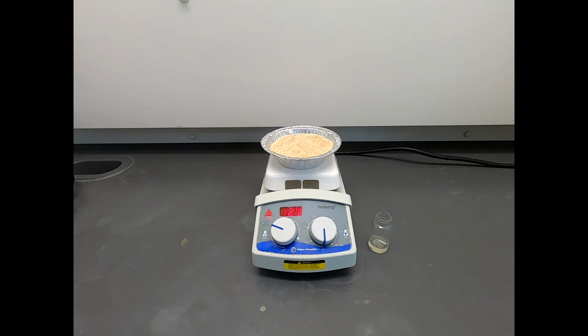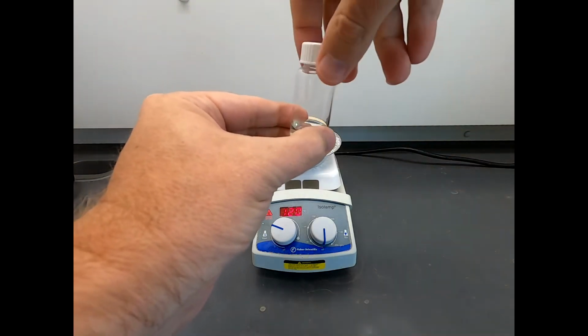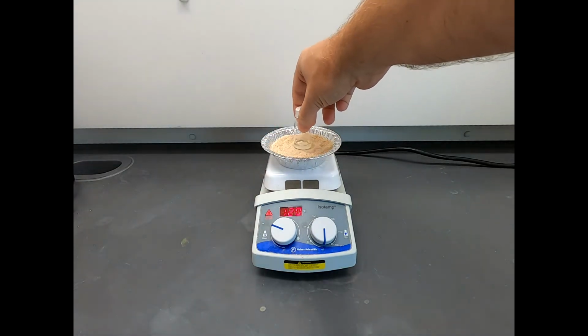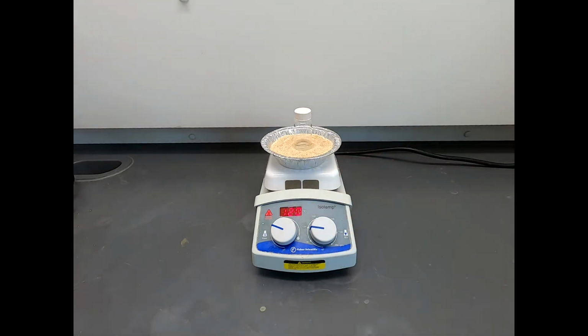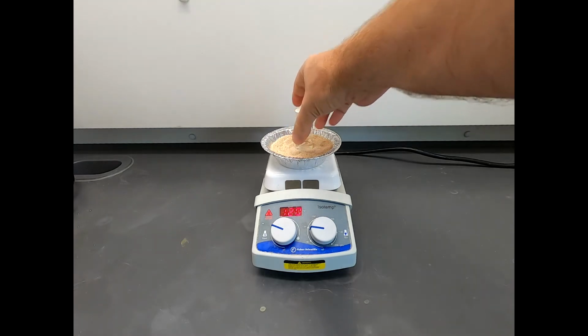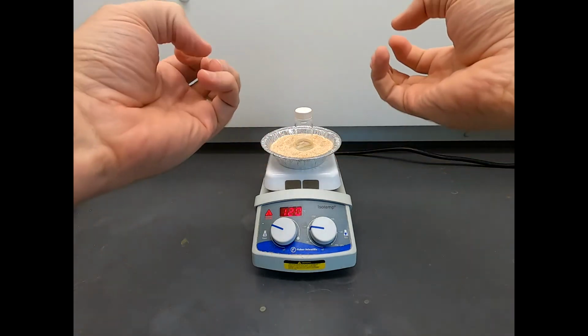And now I'm going to cap it, but I'm not going to really tighten the threads, just engage the threads. Swirl this around a little bit. And now I'm going to place it on the hot plate. Now this hot plate is set up for about a 120 degree sand bath. This is what I want for the reaction, but I don't want to start the reaction because I haven't combined everything. So I just want this to gently heat. So I'm just going to place it on top of the sand. That'll get a little warmth. That warmth will help everything dissolve.